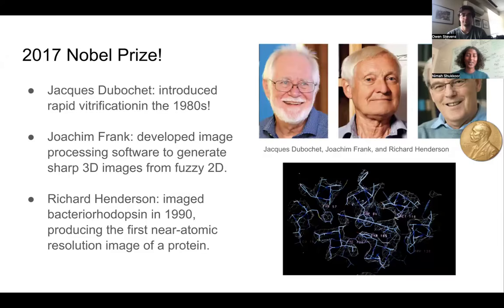So the reason we're talking about this today is because cryo-EM won the 2017 Nobel Prize. Yay! So before this innovation, electron microscopy was thought to only work on dead or dehydrated matter. And so X-ray crystallography and other techniques required forming complex or often impossible crystals of proteins. So cryo-EM has really helped scientists to study molecular machinery in its natural state, which is huge.